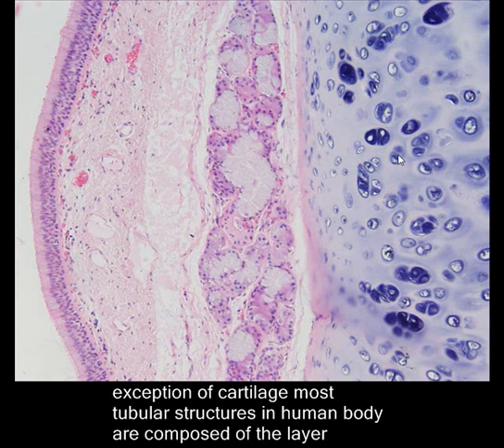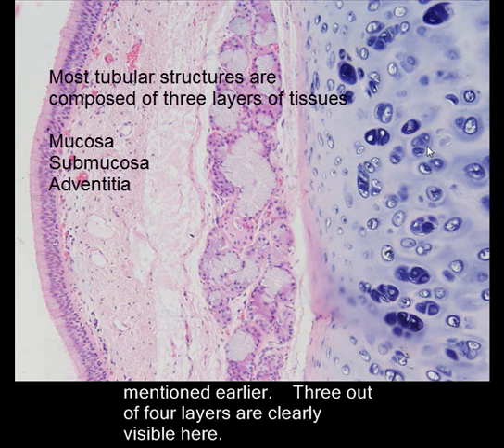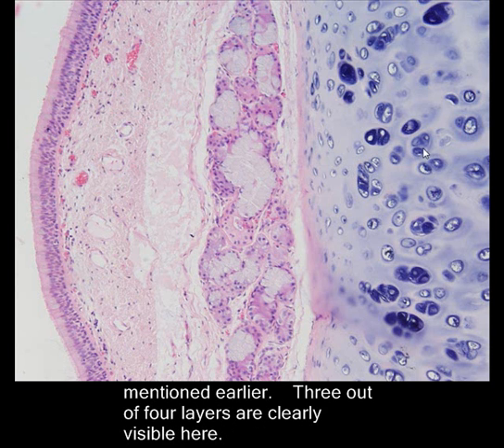With the exception of cartilage, most tubular structures in the human body are composed of the layers mentioned earlier. Three out of four layers are clearly visible here.